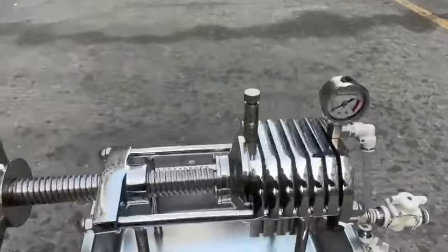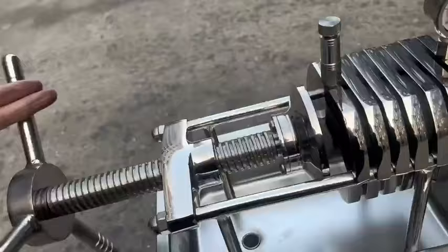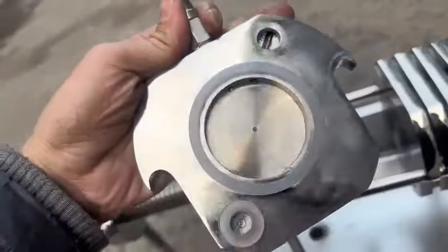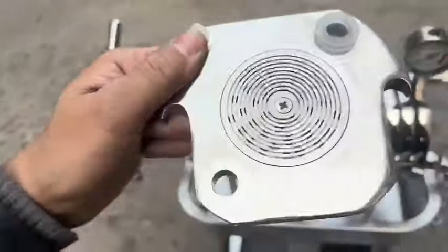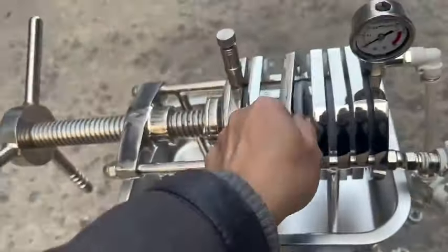Laboratory plate and frame filter, 70mm, 6 layers. Dimensions: length, width, and height of 50cm × 30cm × 50cm. Filter membrane size: 70mm. Paper filter plate size: 60mm.